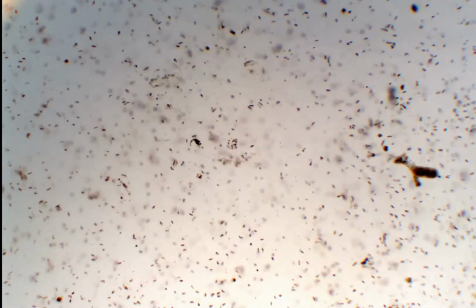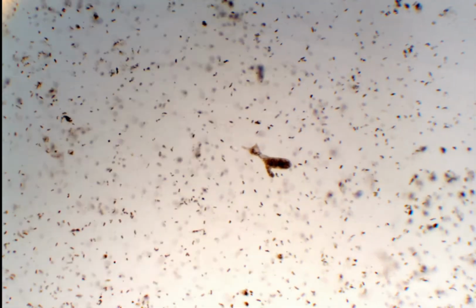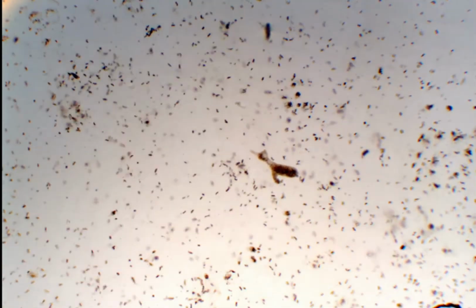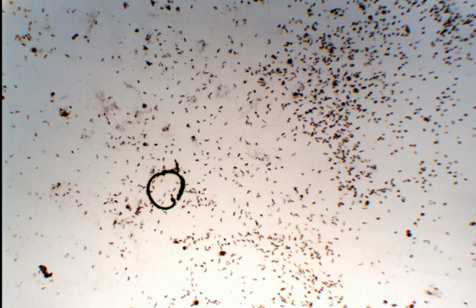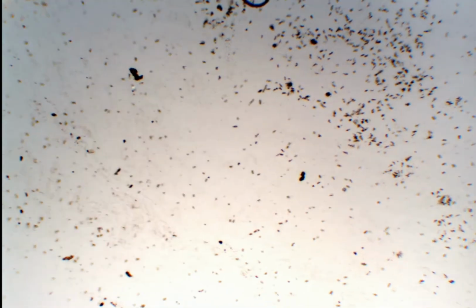And again, the organisms start to go in circles in the first place, and then they will completely die. There you see this going in circles, and almost all the germs are dead now.